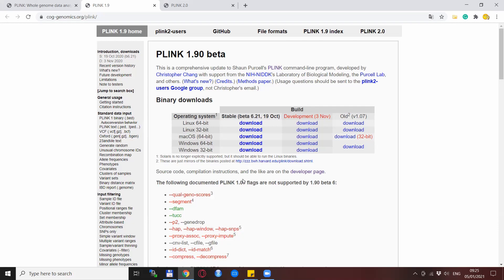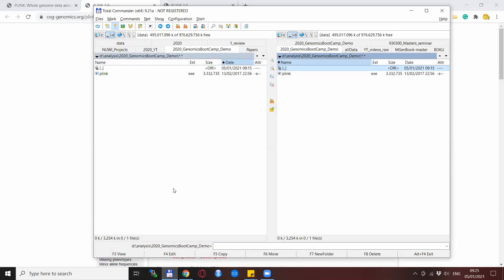So you download it, it will be a zip file, you unzip it and there will be multiple different files but the only relevant one for us is Plink.exe, or without this extension if you are using the Linux or Mac version.